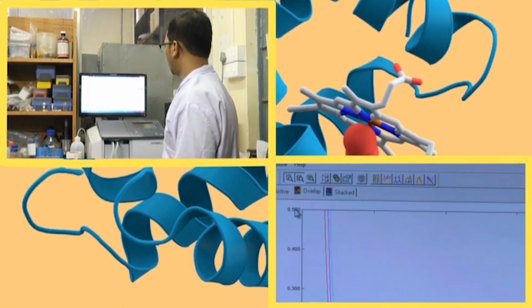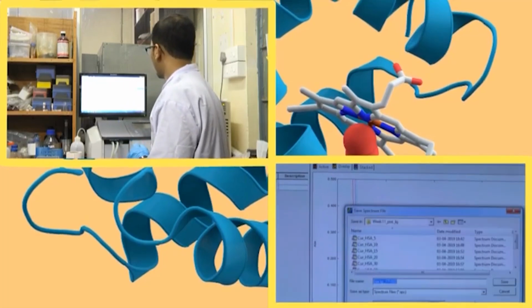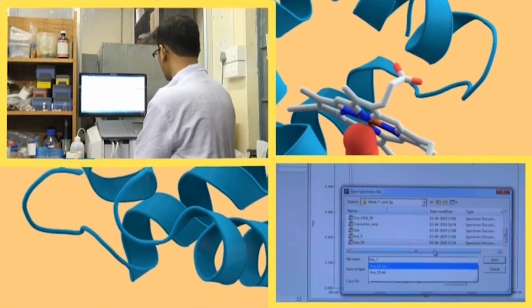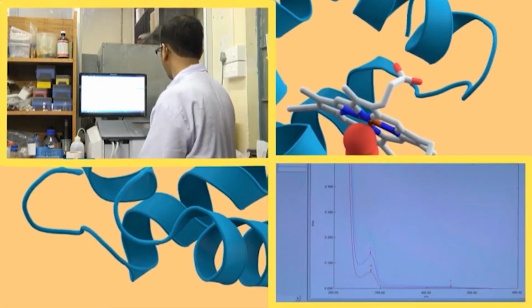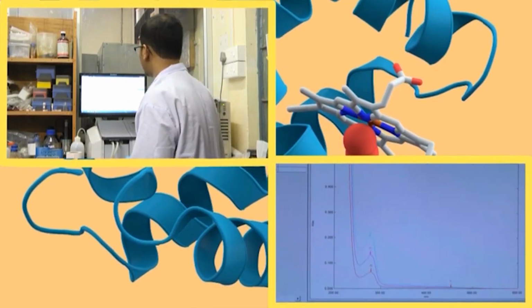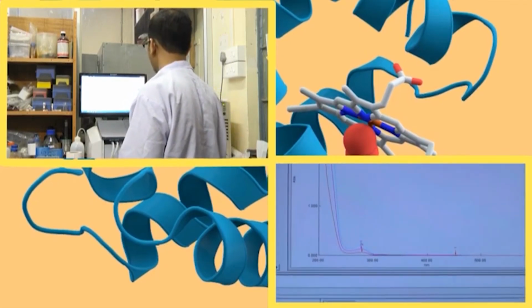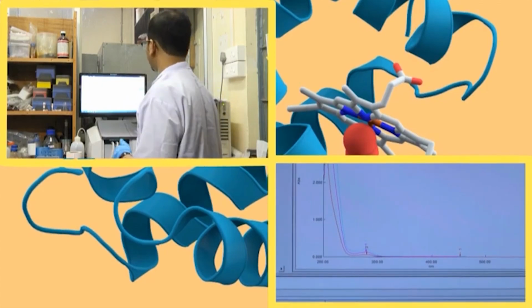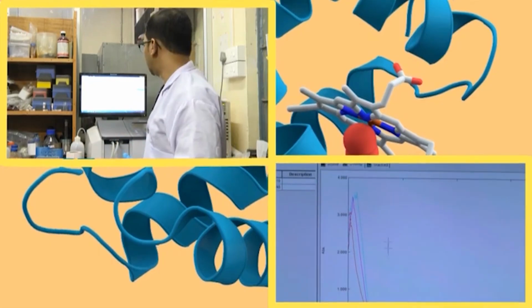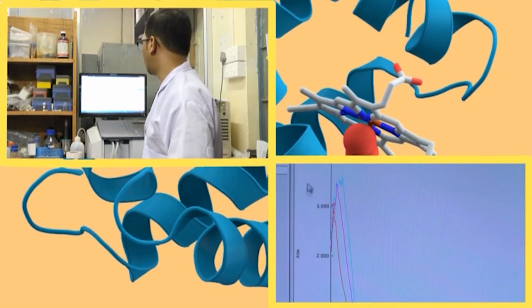These regions, I am showing you, just saving this one. I am saving this as HSA 15. So, these regions, this 2.0 or rather 3, these peaks we have also seen previously when HSA was added to curcumin. We can see the appearance of these sorts of peaks. These are actually the absorbance due to the peptide bond. Okay.